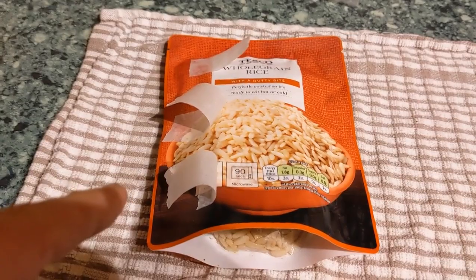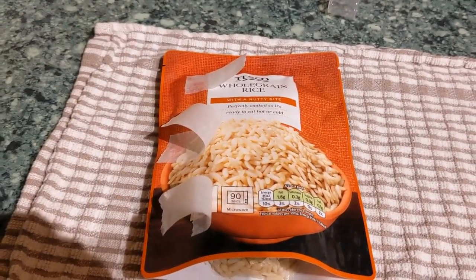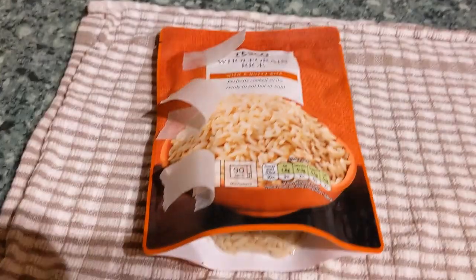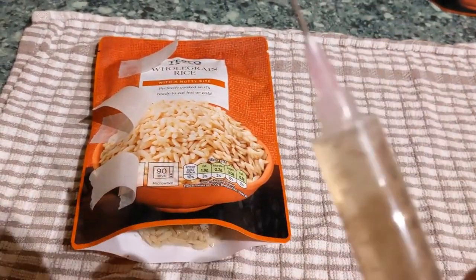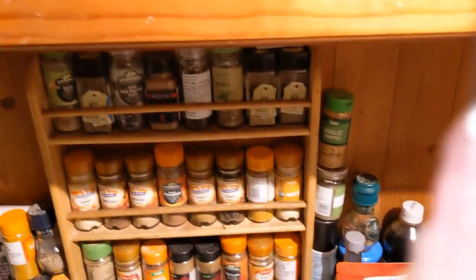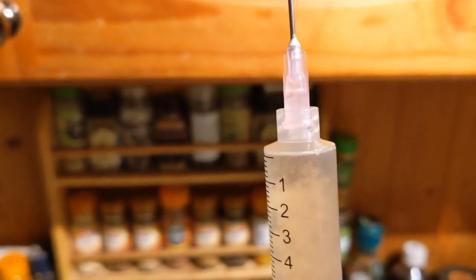Okay, so that's microporous tape, sort of surgical tape, microporous surgical tape. What I'm going to do is I'm going to inject in two locations. I'm going to inject there and there. I'm going to be giving it 10 cc's in each location. So I think the first thing we need to do is to get rid of the air bubble, innit? Just got to be careful. Oh, there we go. Bit came out there.